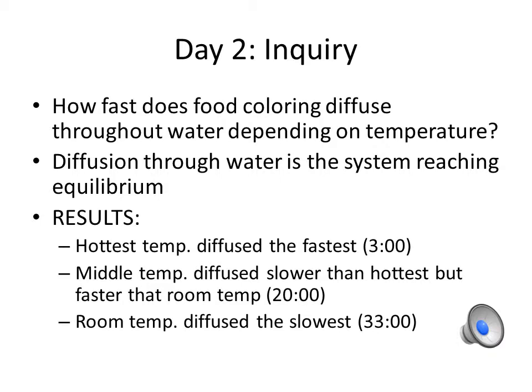And we manipulated temperature. We heated one beaker up to about 80 degrees Celsius. The second beaker of water, we heated up to about 50 degrees Celsius. And the third beaker of water, we kept at room temperature straight out of the faucet.